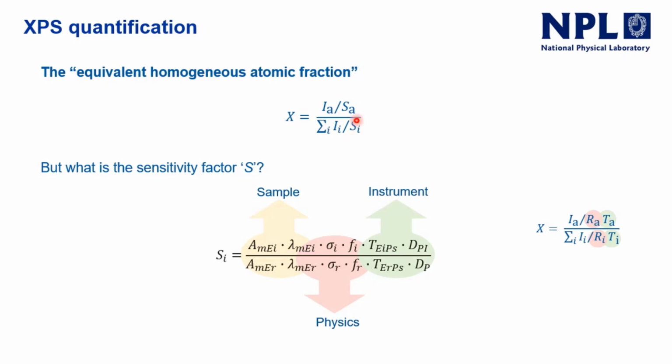So what is this sensitivity factor? This sensitivity factor comes from a lot of stuff from the sample, some stuff from physics, and some stuff from the instrument. So if you, like you did in the old days, and you mentioned an ES100 that went to Durham University, I did my PhD on that instrument. It was still working. Not in 1969, a little bit later on, yeah. But it was still just about hobbling on.